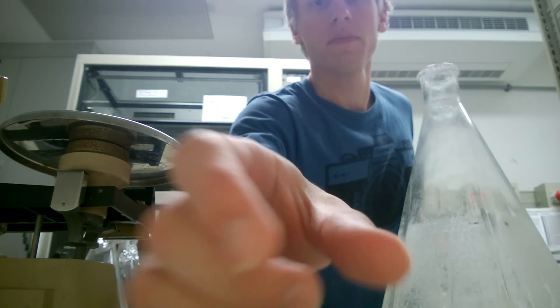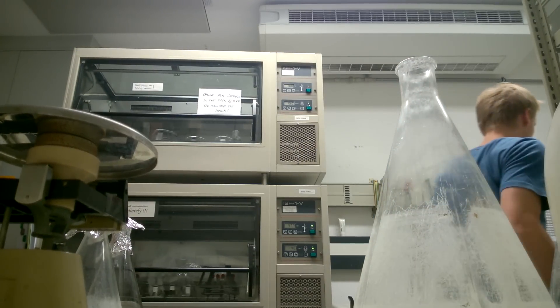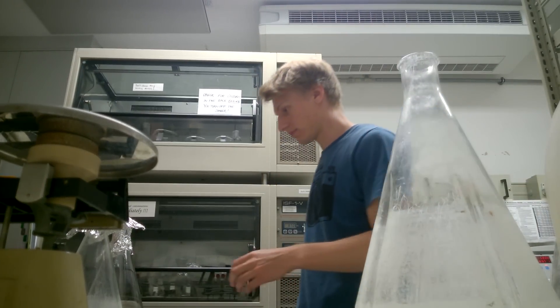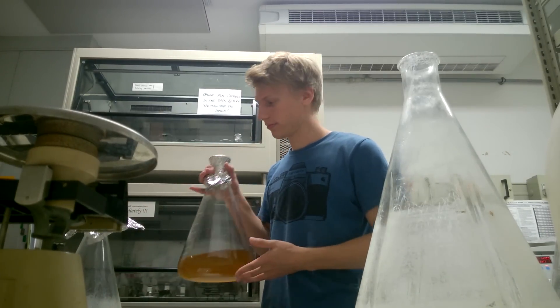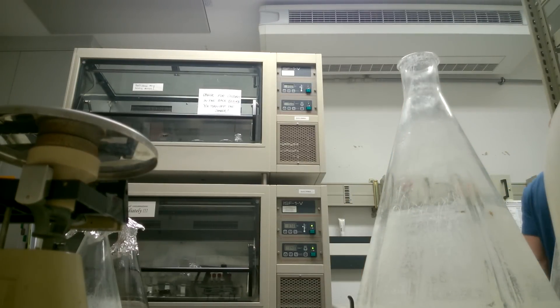Hey guys, my name is Fab and welcome back to another vlog. This is basically part two to the vlog of last week in the lab. At the end of last vlog I showed you my six liters of culture — you can see it there in the incubator — and today I recorded a little bit of the harvest procedure of these yeast cultures.